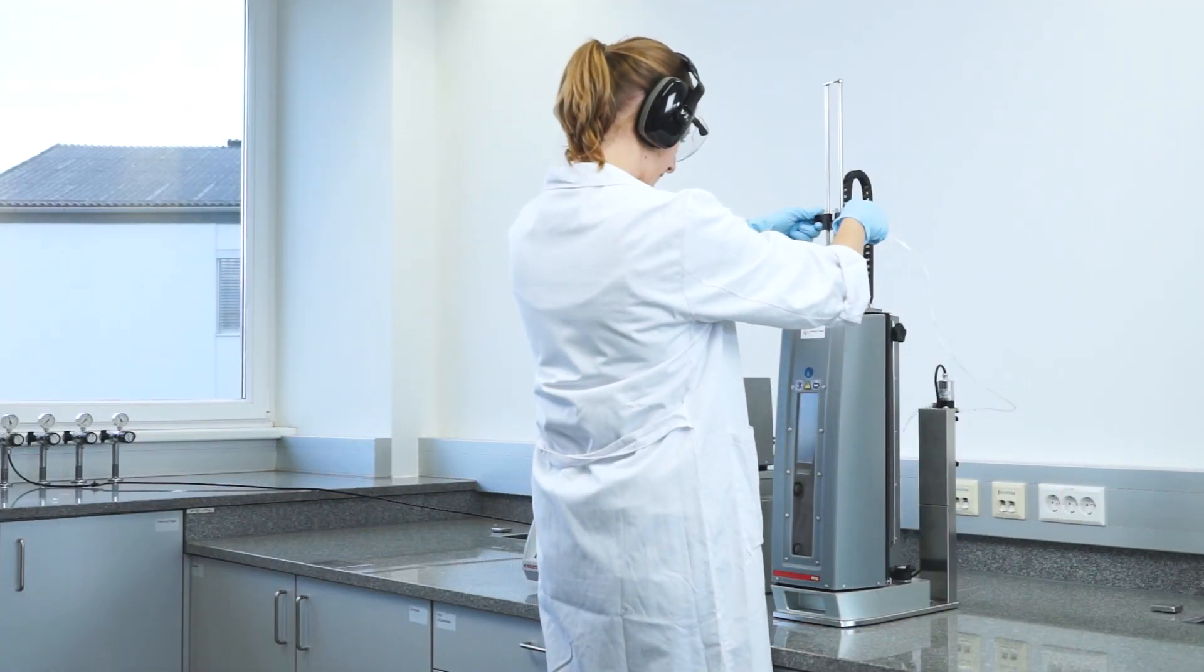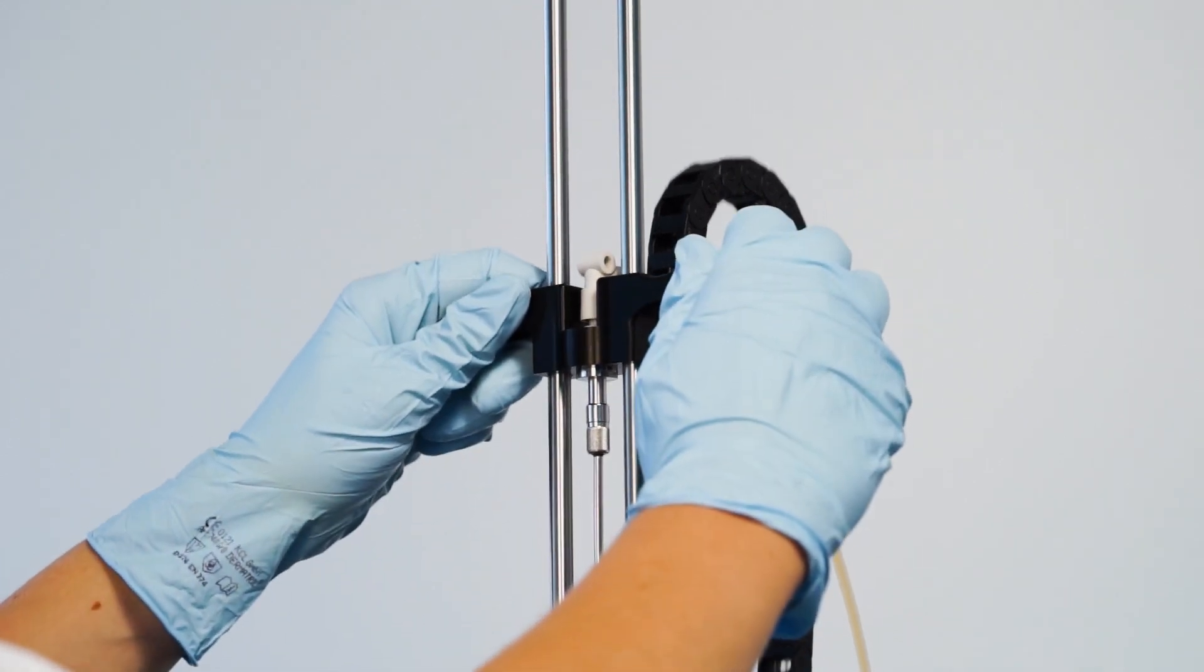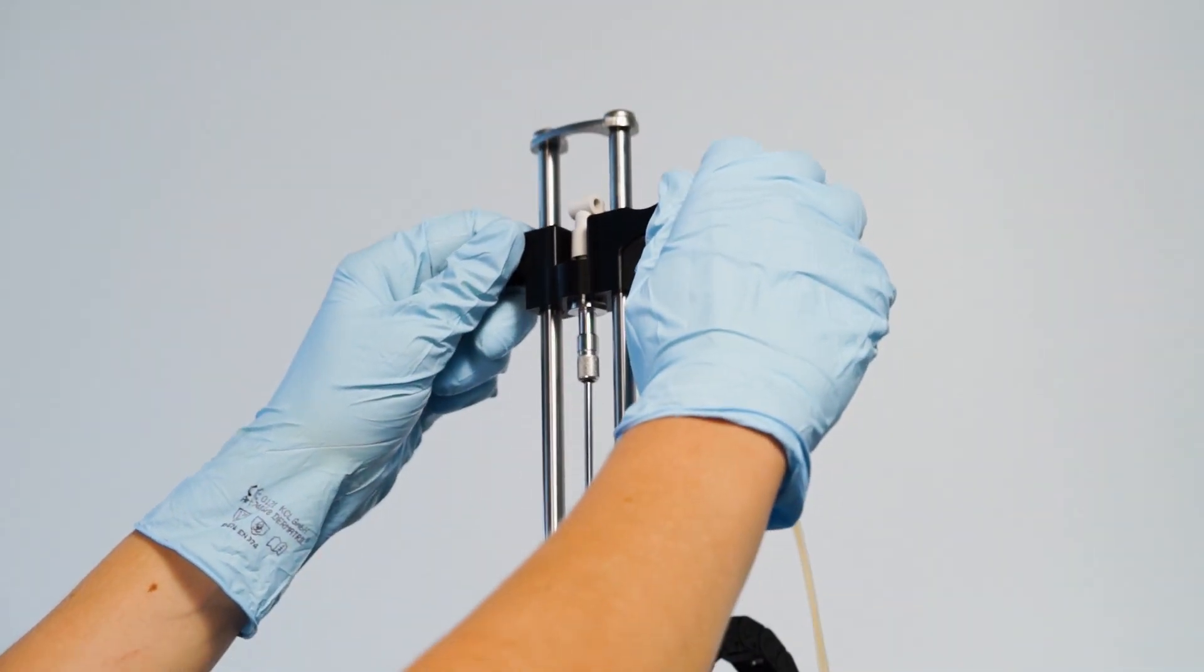To remove the container after your measurement is done, raise the filling tube, release the pressure, and open the safety shield.